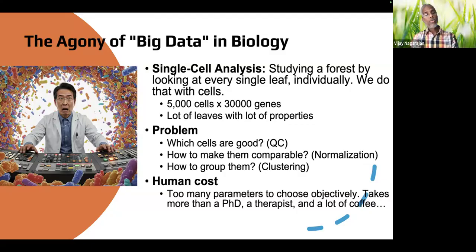And then on top of that, you do some more cool analysis like trajectory analysis or velocity analysis, where you can explore the possibility of tracing the sequence of a cell from its starting point, a real starting point or a time point, or a hypothetical starting point, all the way through a particular gene's expression from that point to all other points, all other clusters.